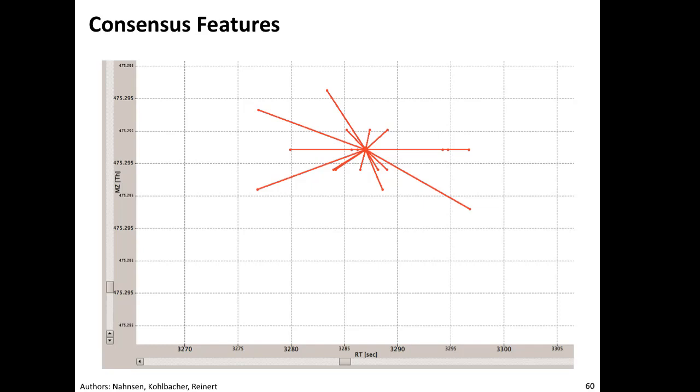If you measure 1,000 samples, you will have samples where something went wrong. And if you try to align these guys with all the rest, then it's not going to be helpful. I really recommend doing some quality control. We also have quality control in this tutorial. I will not talk about it right here, but I can only encourage you to look at that. It's really essential. If you don't do it, you run into trouble.